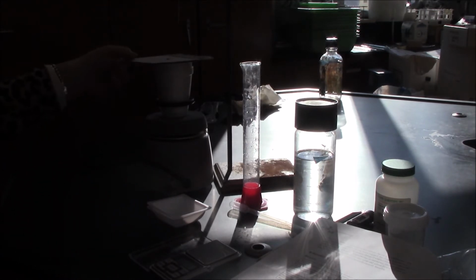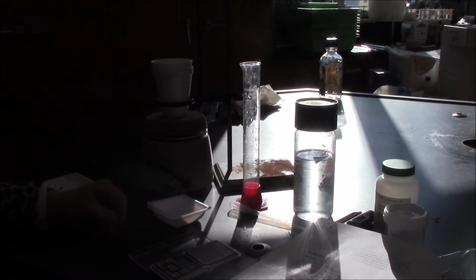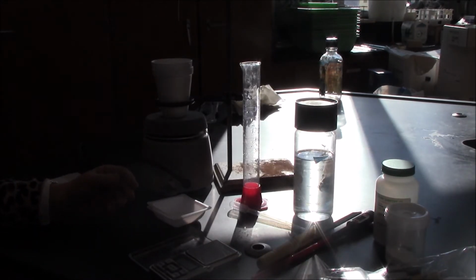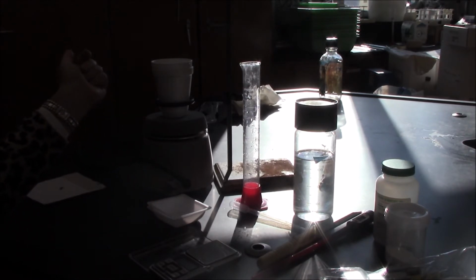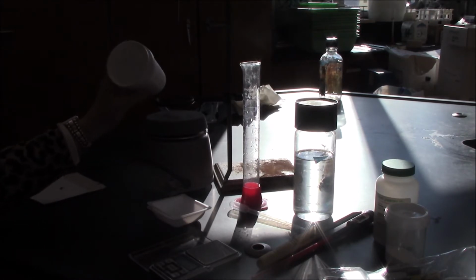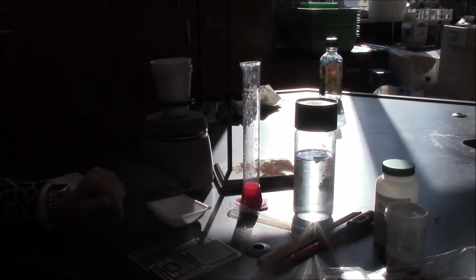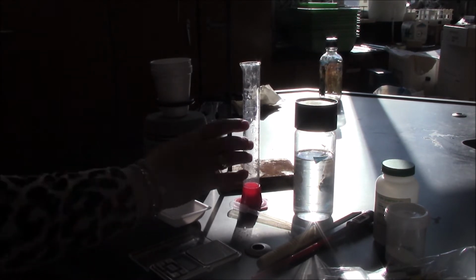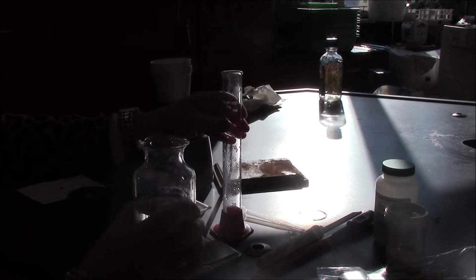So as I said, to start, what I need to do is simply practice what my procedure will be a little bit later on in the lab. What I'm asked to do here initially is to assemble my calorimeter apparatus, and I have this here. I have a stir plate, my double insulated coffee cup calorimeter. Within there, I have a stir bar, which you may or may not be able to see. I have my thermometer, and then over here to my right, I have water, and I have two different solids. Okay. First thing I'm asked to do, once my setup is complete, is to measure out 100 milliliters of water.